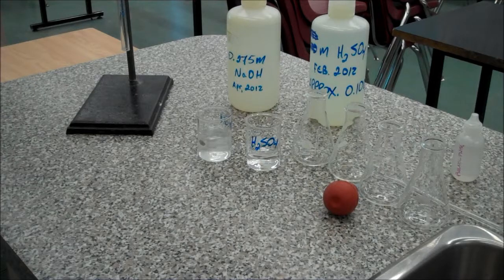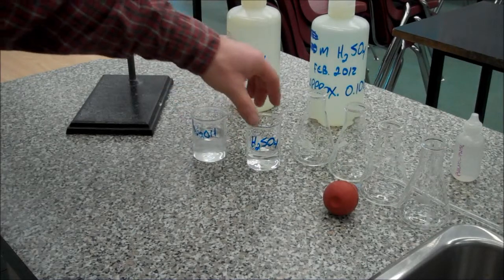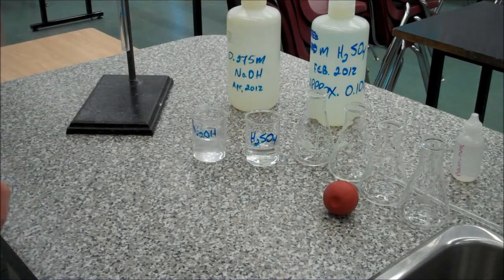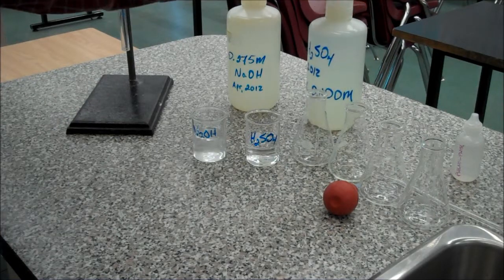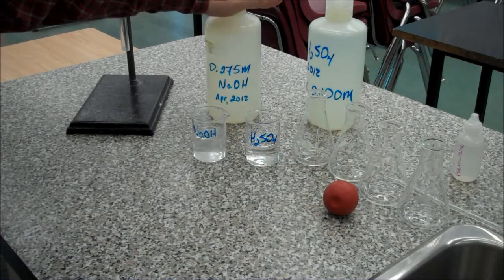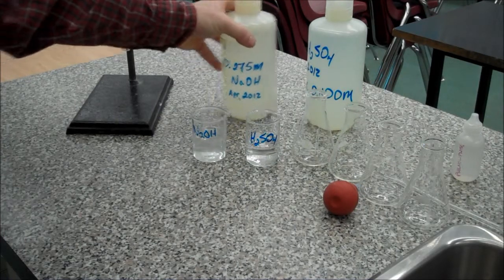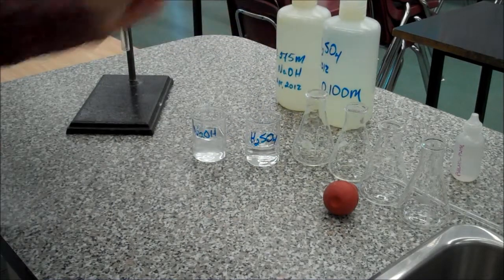Okay, so this is the Titration Lab, and we've labeled our 100 ml beakers. We've taken approximately 60 ml of each solution: sulfuric acid, which is approximately 0.1 molar, but we're going to find out what the concentration really is, and sodium hydroxide, which is 0.275 molar. And so that's what we've got in our beakers.